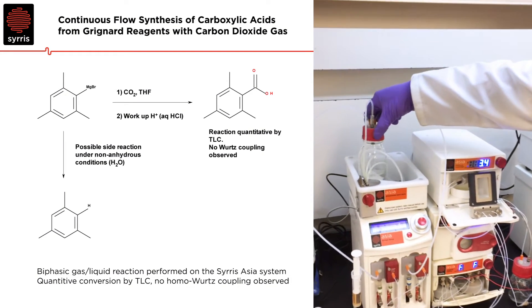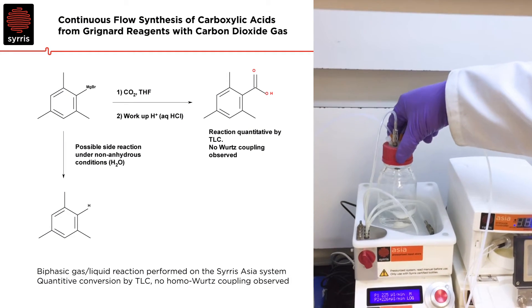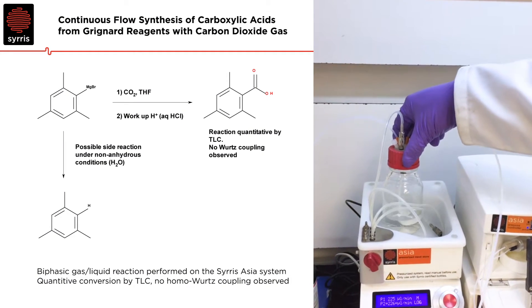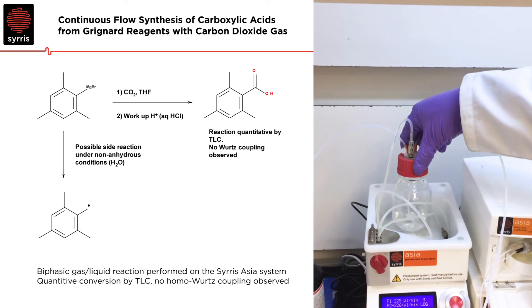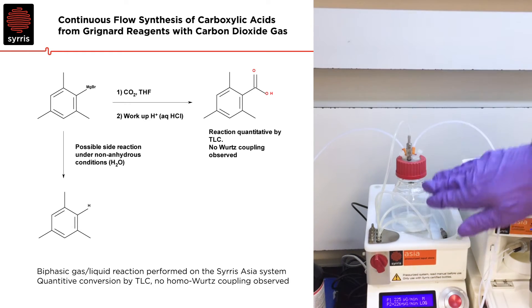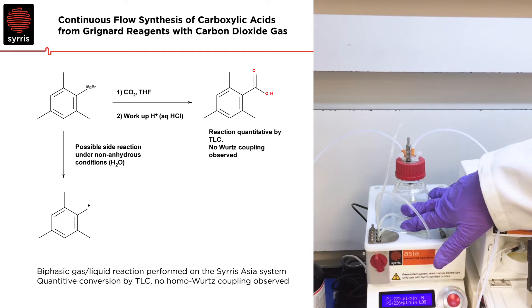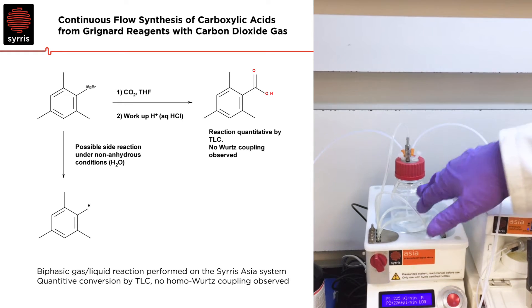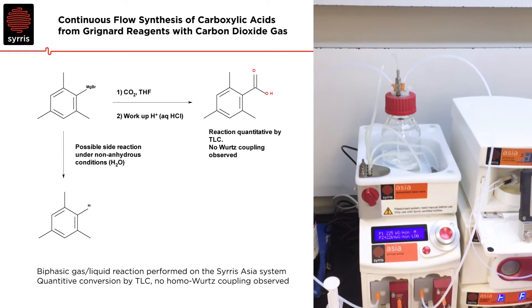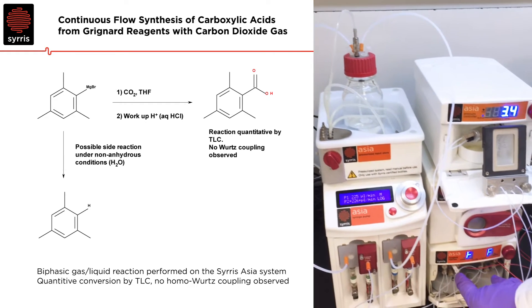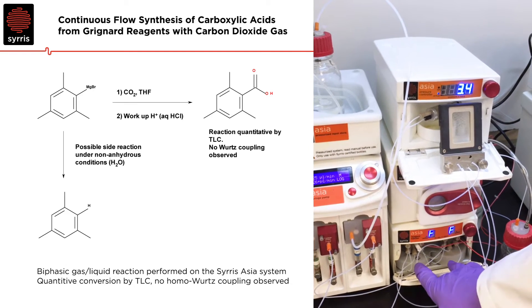To do that with the setup, we have our reagents in our pressurised input store under nitrogen, so we're keeping our solvent under inert conditions, and we're going to inject our reagents into the Asia reagent injector.